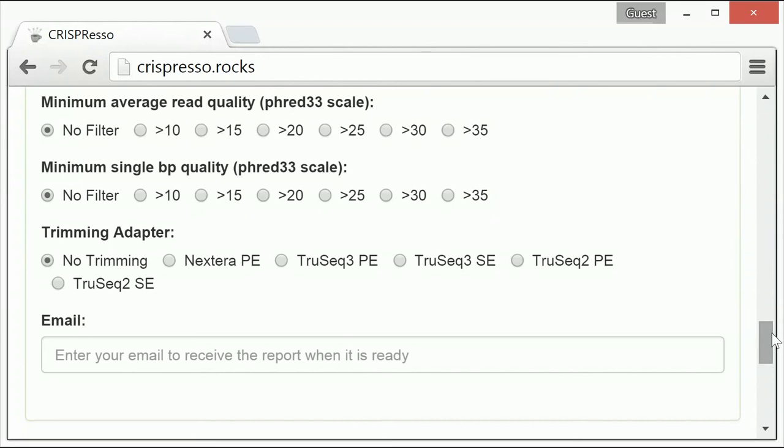The default for CRISPResso is no filtering. However, a reasonable value for this parameter is greater than 30.